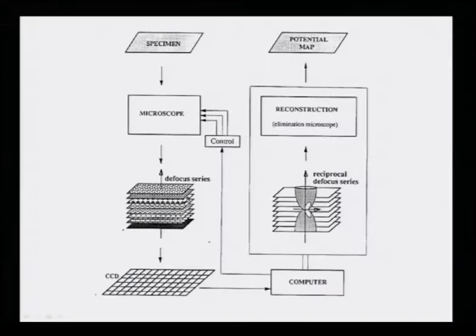During the imaging process, the electrons undergo three distinct interactions, if we have to list them in a very short form, and each of these interactions can be simulated in a computer. The first interaction the electron undergoes is because of the dynamical scattering of the electrons in the sample or the specimen, and this can be simulated.